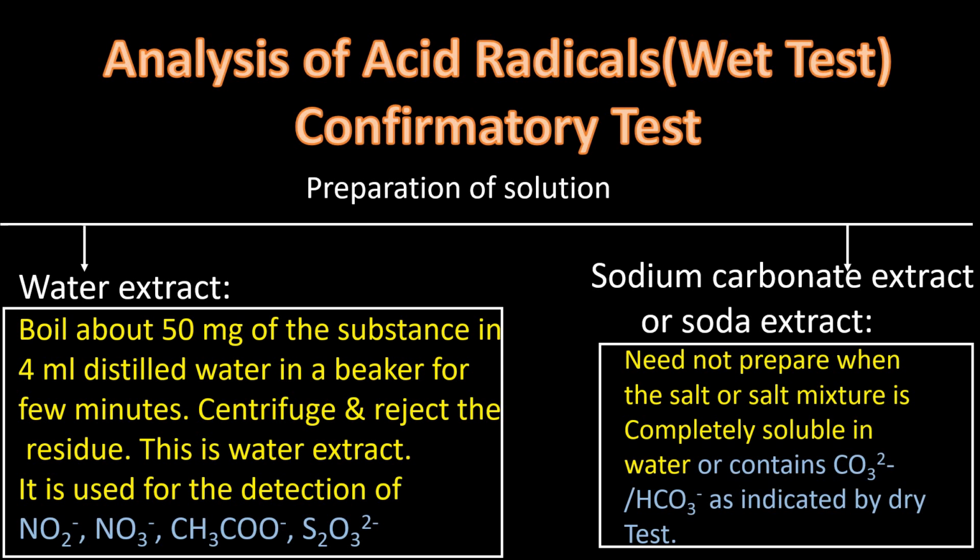In that case, no need to prepare the sodium carbonate extract. Another thing is that if the dry test gives you the indication that your salt or salt mixture may contain carbonate or bicarbonate, in that case also you need not prepare the sodium carbonate extract.